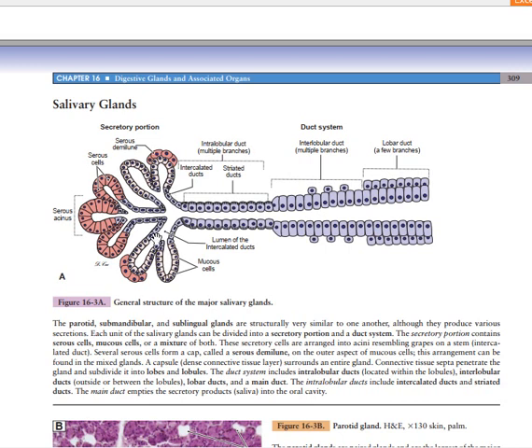So this is a schematic representation. As you can see here, it is more pinkish because of the coloration by the granules, and these are mostly serous acini with serous cells, and these are the ducts of the serous acini. As you have seen before, this resembles a round-bottom flask, which shows that it's an acinus. Is it clear? And here is a tubule, because it's shaped just like a test tube, as you have seen in the gland histology before.